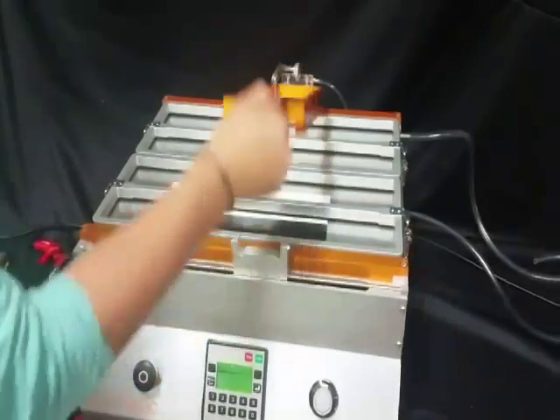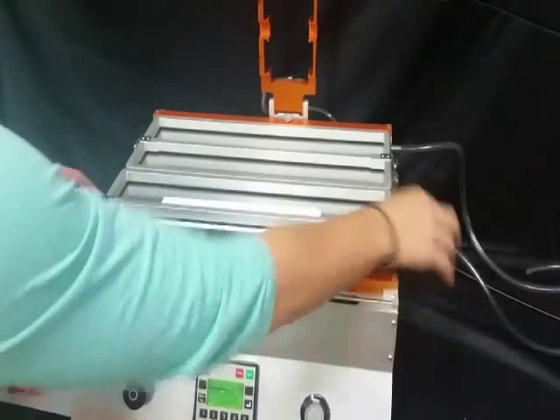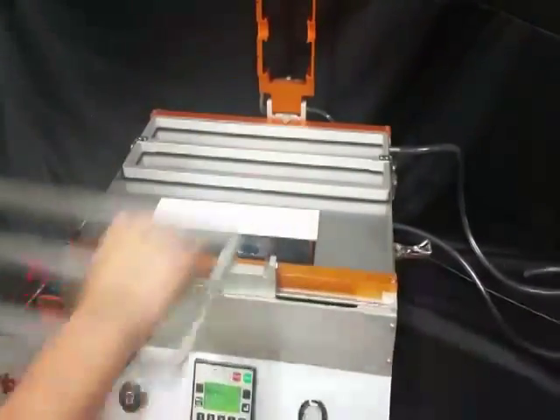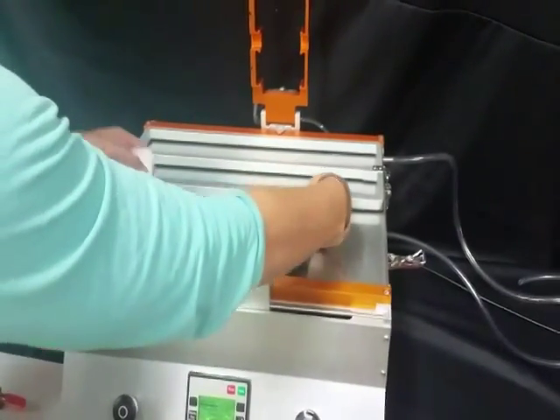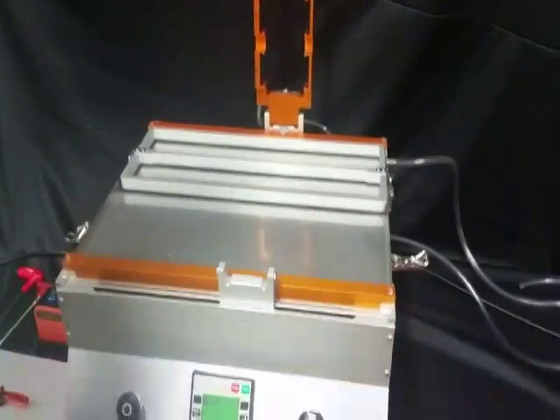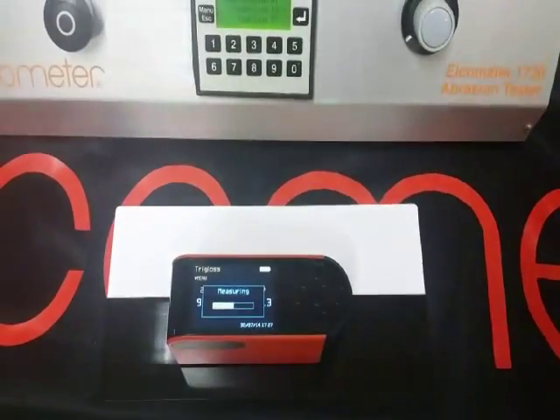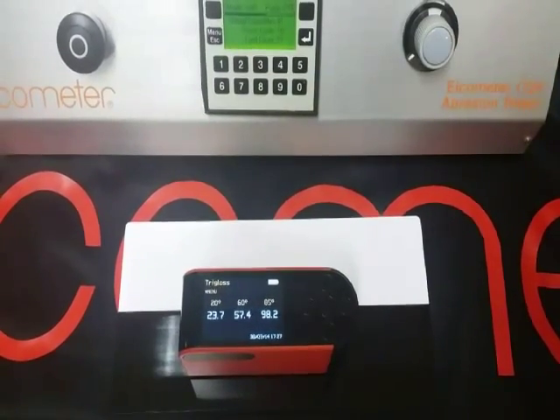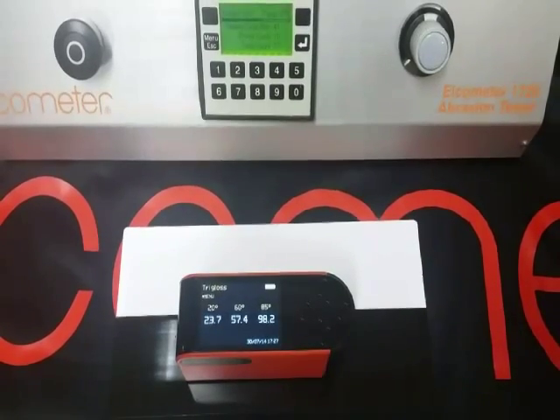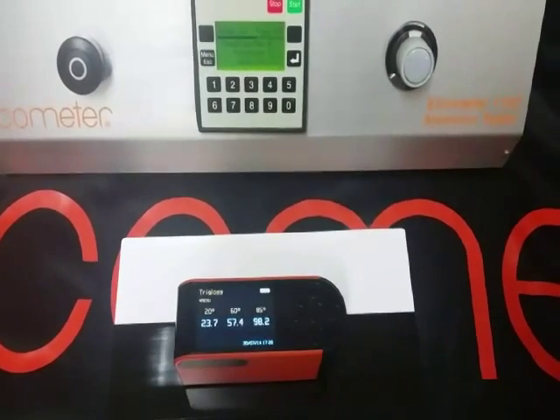We will now remove the test panel from the machine and measure again with the Elcometer 407 Gloss Meter. After testing, at the 60 degree angle, the reading is 57.4 gloss units. Before testing, the unit read 95.3 gloss units.